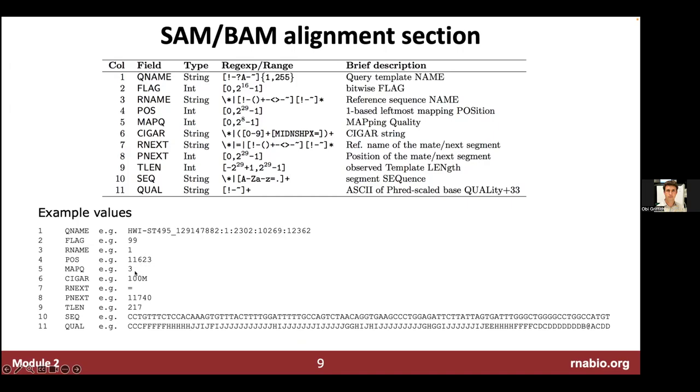Then there's something called mapping quality. This gives you a sense for the overall read: what's the uniqueness of the mapping of that read to the genome, or whatever your reference is that you're aligning against? We talked a little bit yesterday about multi-mapping, right? If your read maps to many different places ambiguously in the genome, it would have a very poor, low mapping quality score. Most of the time, your reads hopefully are long reads and they're mapping to unique parts of the genome, so they would have good mapping quality scores. What's a good mapping quality score? 60? Three is low, yeah. Three is bad.